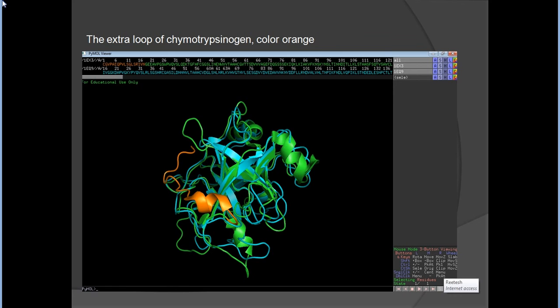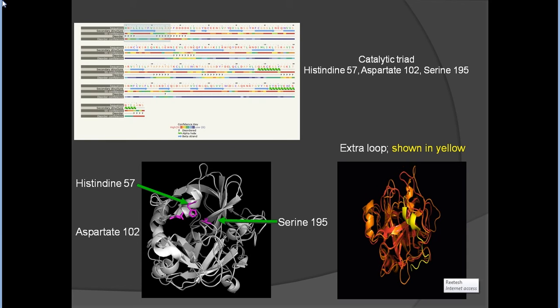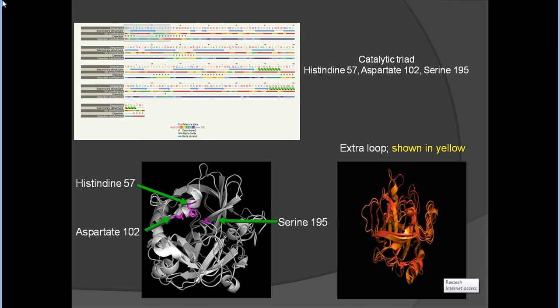This extra slide provides information about the extra loop of chymotrypsinogen, because chymotrypsinogen is the precursor of chymotrypsin. Another slide depicts the catalytic triad: histidine 57, aspartate 102, and serine 195. The extra loop zones are shown in yellow.